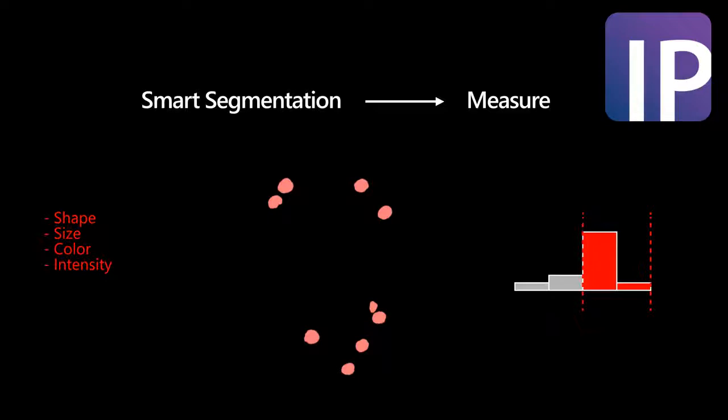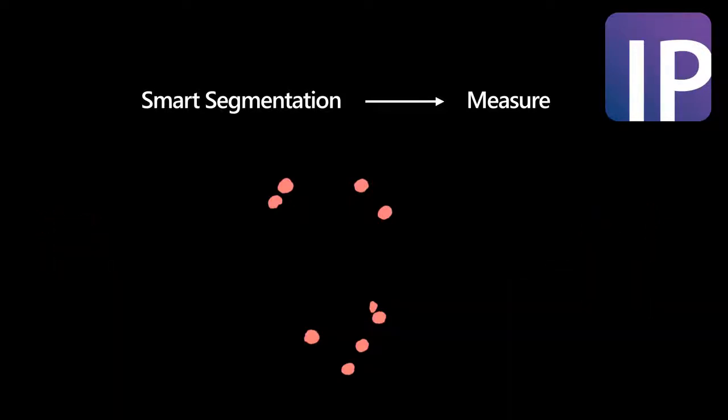Should some objects need to be excluded from the selection, filter ranges can be easily set based on shape, size, color, and intensity. Further refining the specificity of the filtered results to the original objects of interest is done to optimize the results.